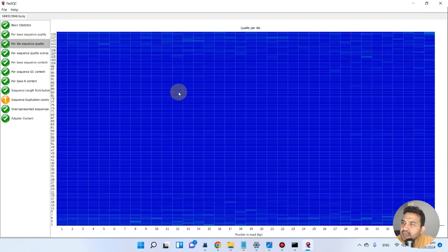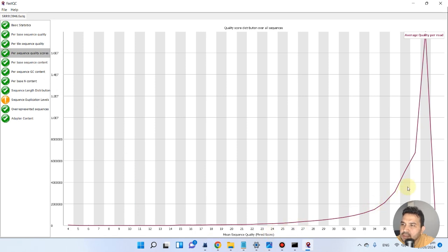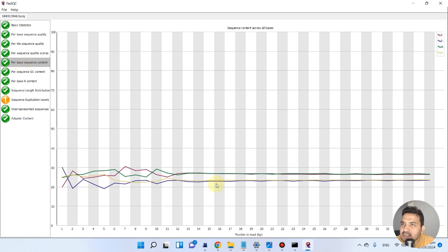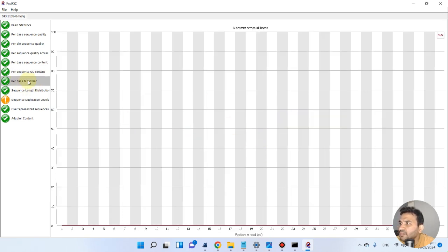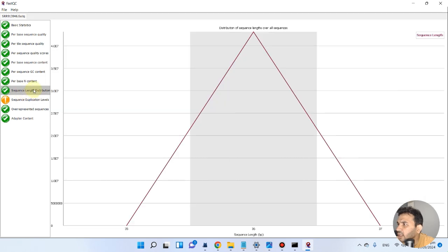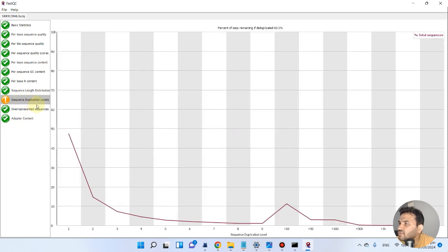The per-tile sequence quality heat map looks fine — nothing is wrong. The per-sequence quality score shows the mean sequence quality average is fine. The A/T and C/G levels are balanced. The GC content follows the theoretical distribution as expected. The per-base N content is also very fine. The sequence length distribution is up to the mark. For sequence duplication level, reads with one or two copies can naturally be duplicated, and there is a bit more at higher levels, but overall it is acceptable.